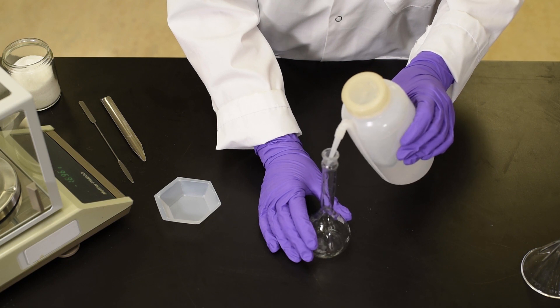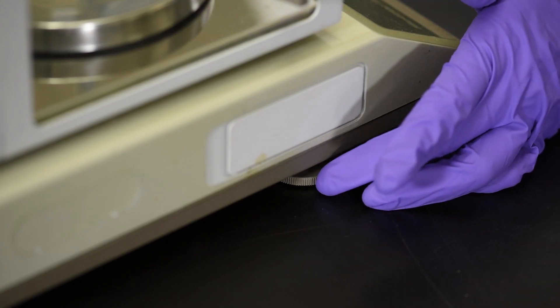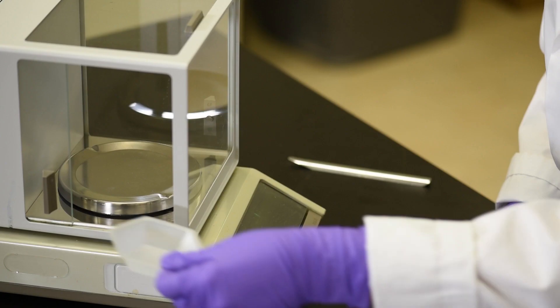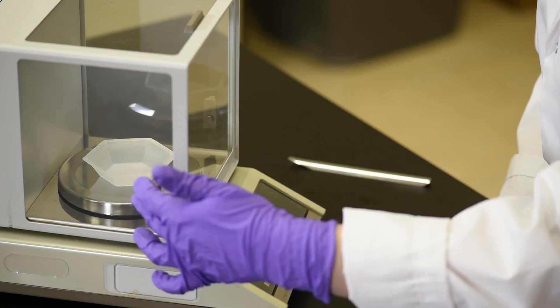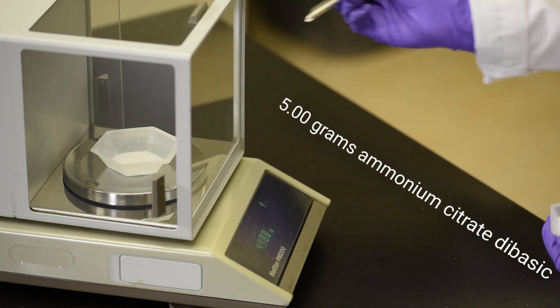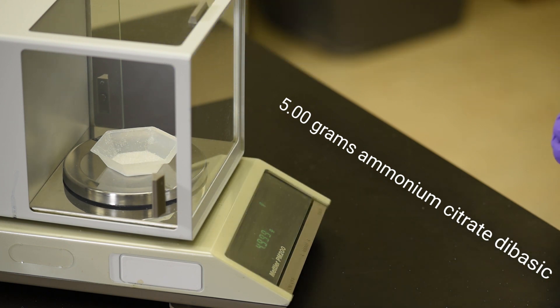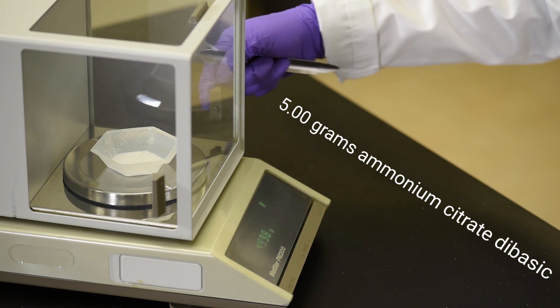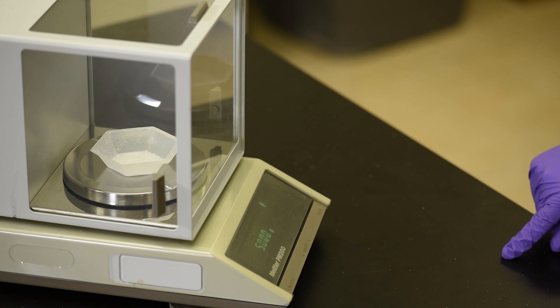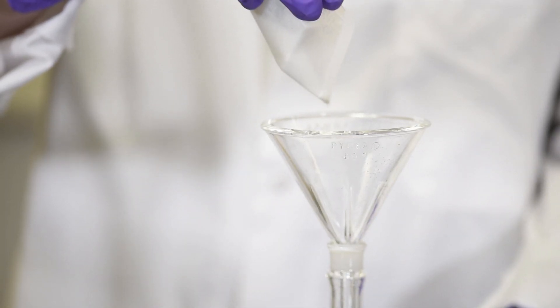First, I partially fill my flask with distilled water, the solvent. Next, I make sure my analytical balance is level. I place my weighing dish on the balance, close the glass doors, and set the balance to zero. I weigh out 5.00 grams of ammonium citrate dibasic, the solute, into my weigh dish, and again I close the doors to check the final reading on the balance.